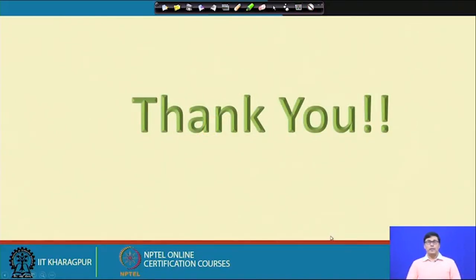So, in this particular lecture, I tried to point out how important downstream processing is in the biochemical industry. The step that is common to all chemical and biochemical industry is the separation of the particles. Separation of the particles can be done by different means: with respect to gravity, by using the sedimentation technique; and with respect to force, by using centrifugal force, by using a centrifuge. I discussed membrane filtration, cake filtration and cross flow filtration, and we tried to find out the specific cake resistance, or the resistance of the cake, and how the angular velocity of the centrifuge is proportional to the percentage separation of the solid particles. Thank you very much.